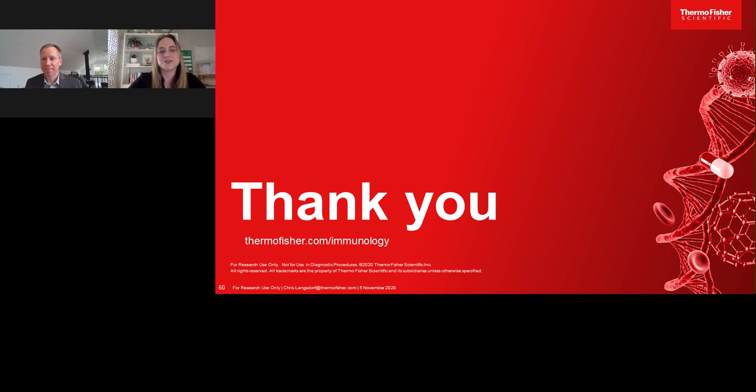Awesome. Okay, next question. Can we use CD28 Dynabeads to check the activation of TIL?